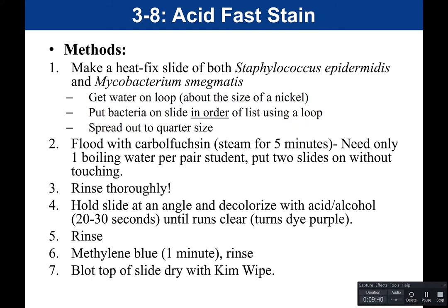During the five minutes, we make sure that the carbolfuchsin does not dry out — we keep adding it to make sure it's covered the entire time. By steaming it, we allow the carbolfuchsin to penetrate acid-fast positive bacteria. At this point, both acid-fast positive and acid-fast negative are going to stain with the carbolfuchsin, so when we start, they're both going to be pink.